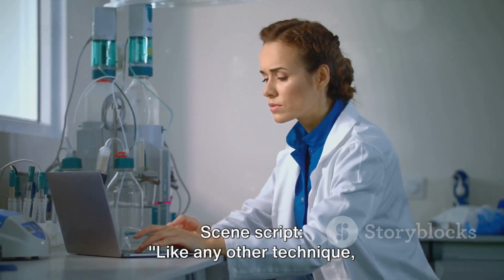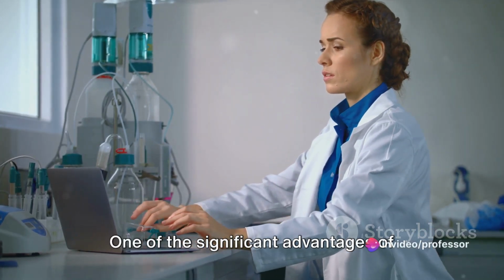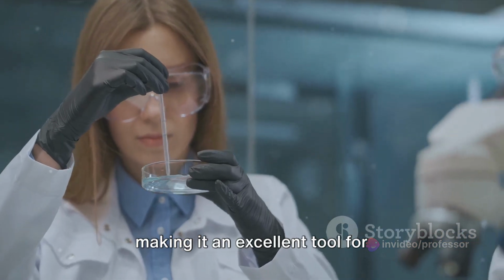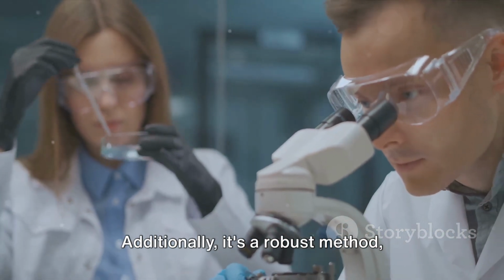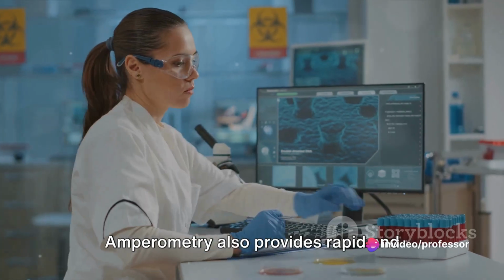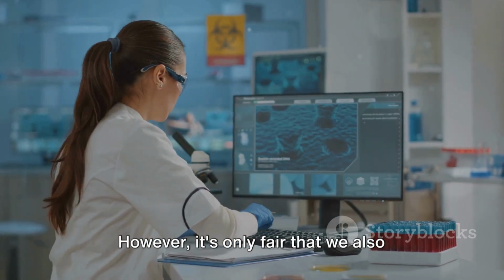Like any other technique, amperometry has its pros and cons. Let's explore them. One of the significant advantages of amperometry is its sensitivity. It can detect minute changes in current, making it an excellent tool for determining low concentrations of various substances. Additionally, it's a robust method, unaffected by color, turbidity, or viscosity of the sample. Amperometry also provides rapid and real-time results, a feature that's particularly useful in monitoring dynamic processes.